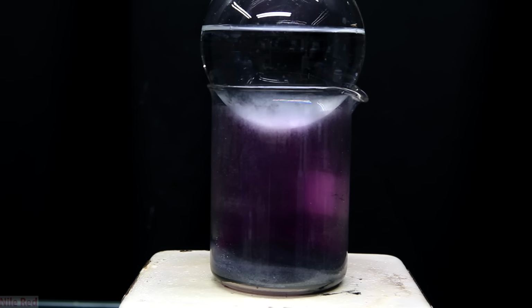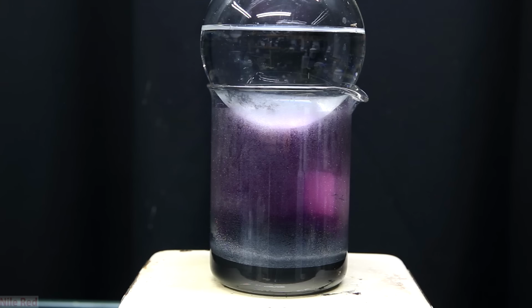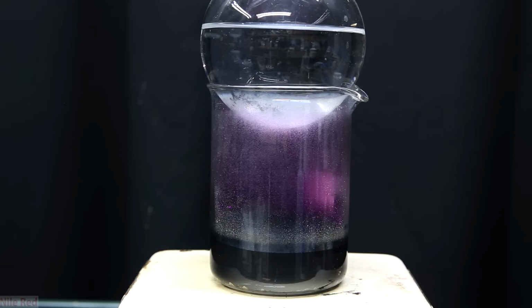Now this here is the interesting part, which I didn't expect because like I said, I was always taught that iodine only sublimated. If you look at the walls of the beaker, you'll see a line climbing up the side. This is actually the vapor front of liquid iodine. As we keep heating, you'll see that it climbs higher and higher up the walls.